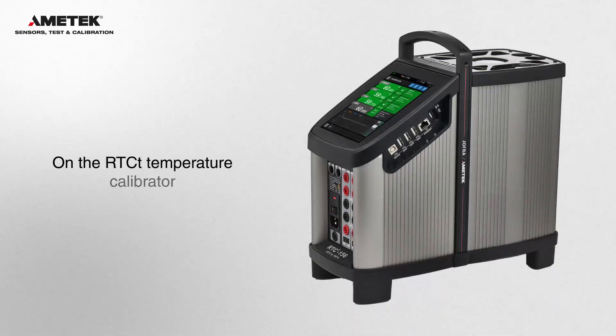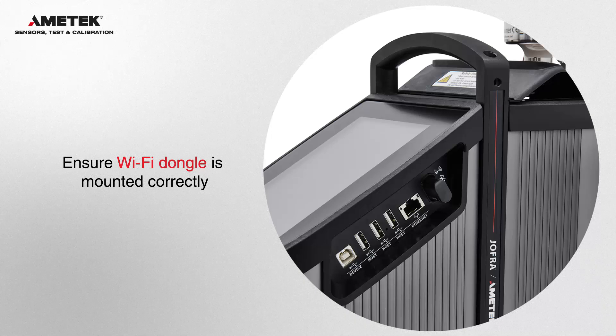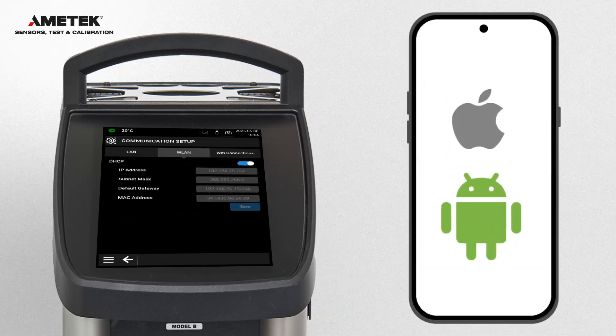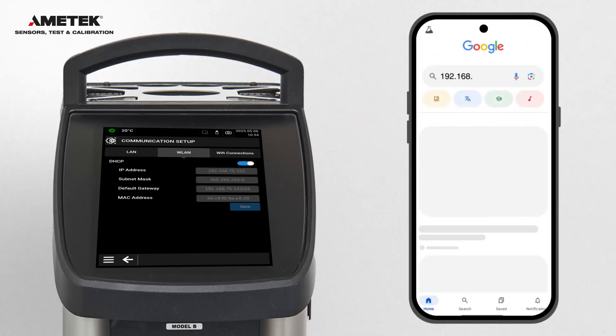Next, turn on the RTCT Temperature Calibrator and ensure the Wi-Fi dongle is correctly mounted. You will be prompted to enter the hotspot Wi-Fi access code. Tap WLAN on the RTCT. Open your mobile browser and enter the IP address of the RTCT.